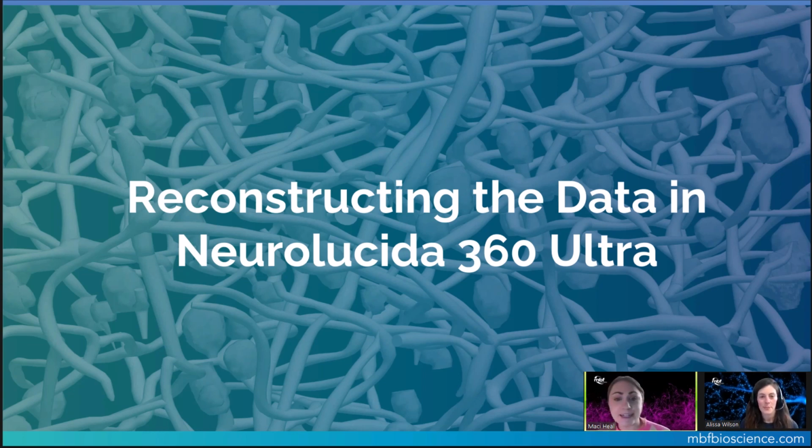And we're just excited in general that we've added the vessel tracing to our Neurolucida 360 software. There's a lot more in the brain than just neurons, and we added it so we can help our fellow researchers address really complex scientific questions about the brain and other organs that they're studying, use it to evaluate animal model efficacy, and just ultimately make new discoveries in your research.